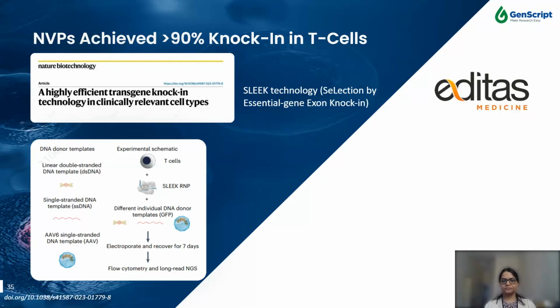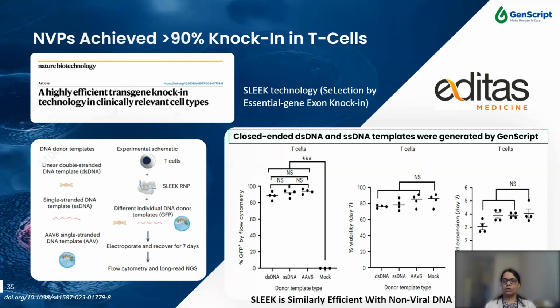Upon comparing the SLEEK knock-in efficiency, day 7 viability and fold expansion among these three various DNA templates, they observed minimal difference between the ssDNA template and AAV6.